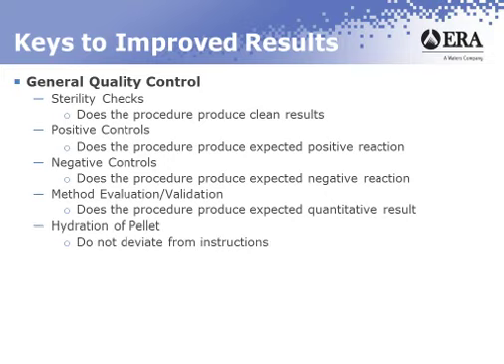Hydration of the pellet. I wanted to touch on this to make sure that everyone understands that you should follow the instructions that you're provided for PTs and QC samples. The reason you don't want to deviate from that is because, as we've discussed with the evaluation criteria, when it comes to a PT, you're evaluated based on the mean of the study data plus or minus 3 standard deviations. The assumption is that everyone is following the instructions in the same fashion.